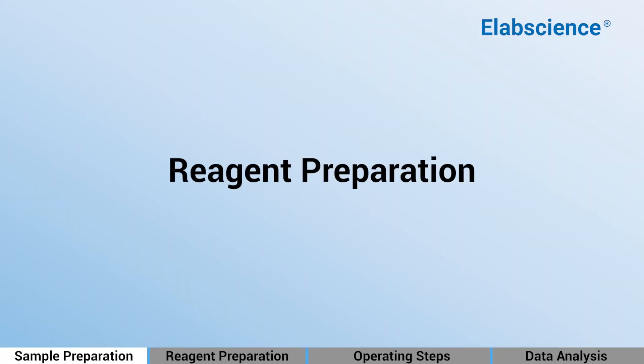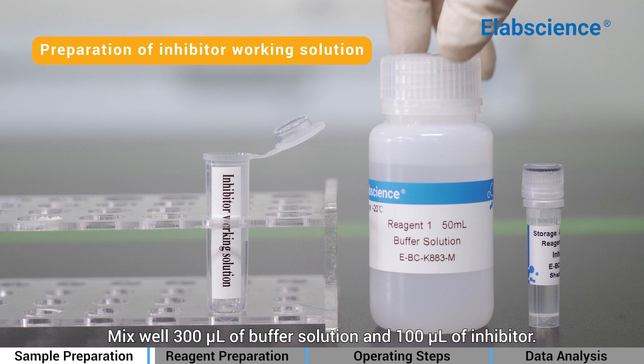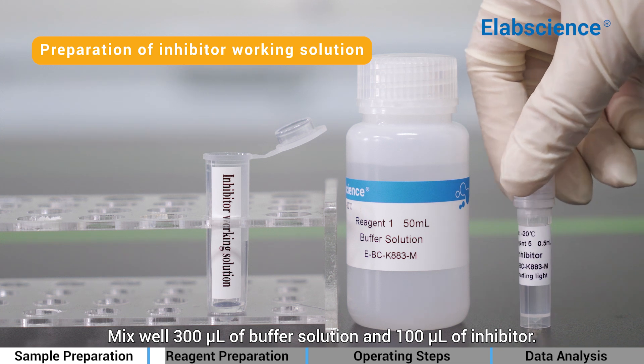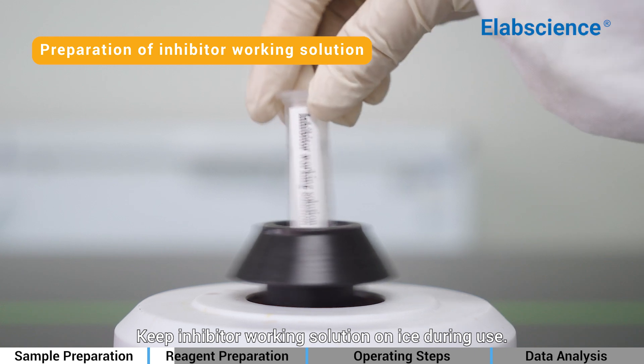Reagent Preparation — Inhibitor Working Solution: Mix well 300 µL of buffer solution with 100 µL of inhibitor. Keep the inhibitor working solution on ice during use.